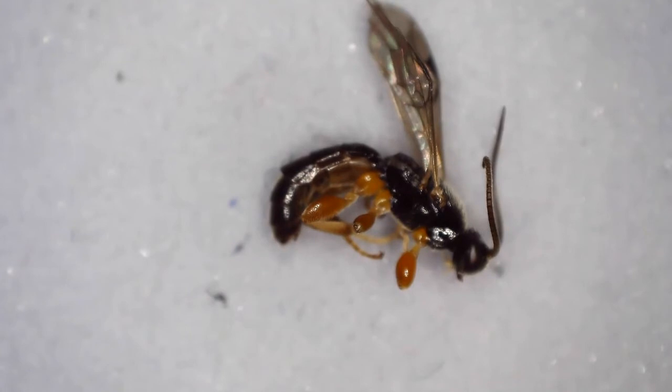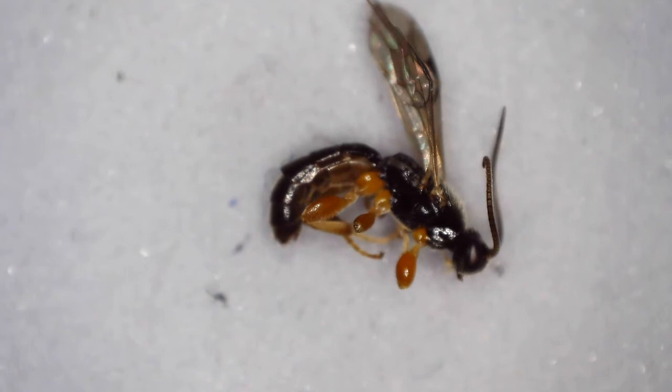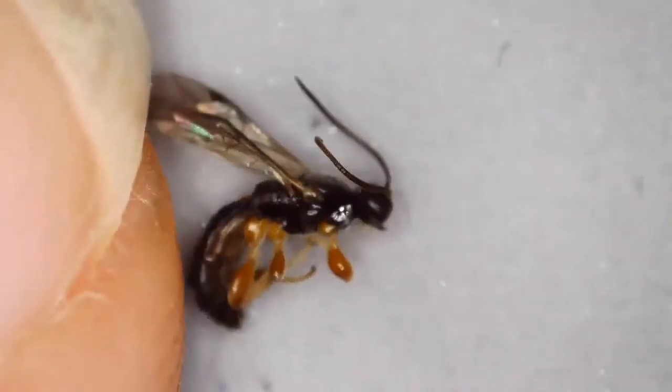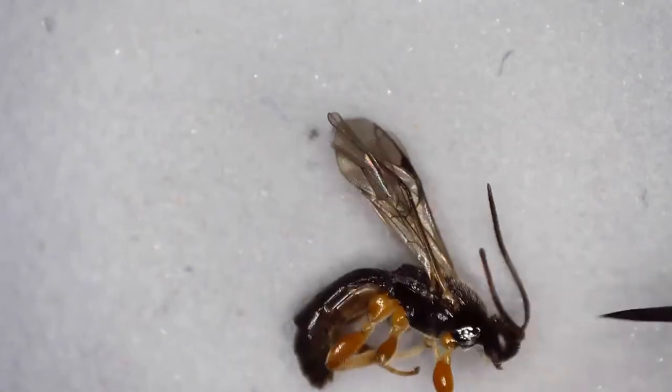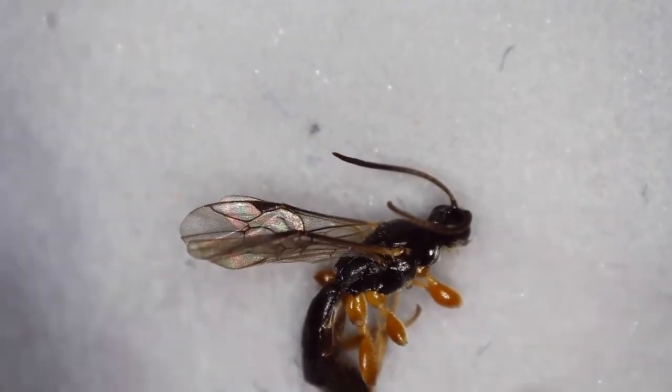I'm going to straighten out that shelf a little bit more just to give me a more shelfy appearance. And I'm applying a little bit of glue to that shelf. And once I have that glue, I'm going to try to put it on the right side of the thorax. So I'm going to shift around my insect here to make that a little bit easier since this is quite small. Getting it to lie down with the right side up is always a little bit of a challenge, but you always point mount on the right side of the thorax, never on the left side.